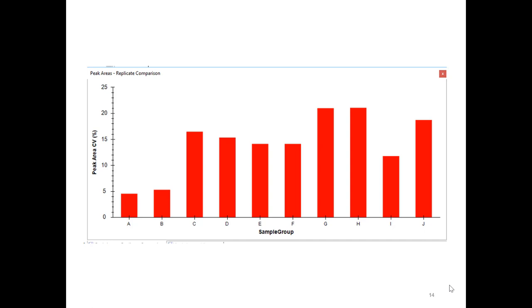That's a point: the background is just a constant signal, so you're going to see it look relatively stable across the number of times you do your sections. So I guess to me, visually, I'm just thinking that LOQ is going to be far higher than anything even remotely close to the background signal. That's all. By another method, it would.